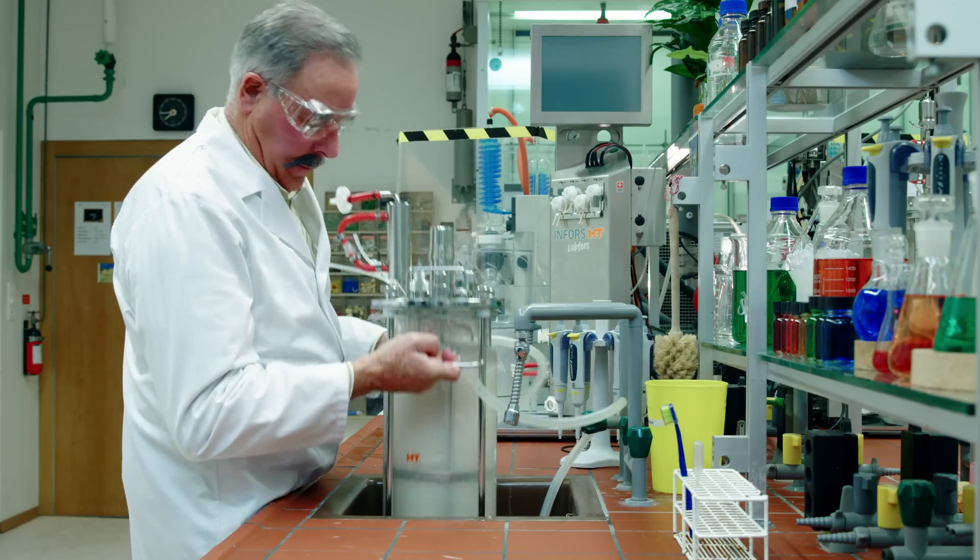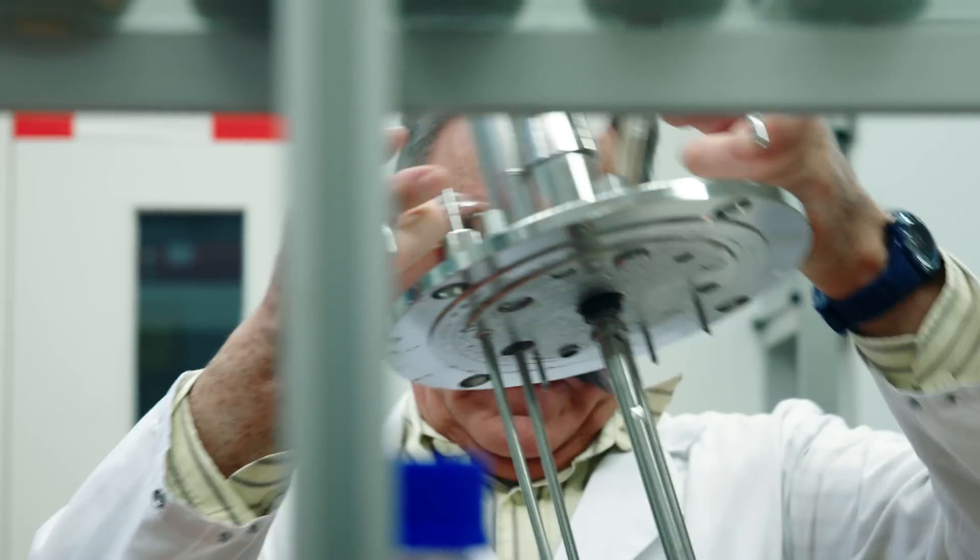Every week, Mr. Müller has to clean and sterilize his bioreactor.